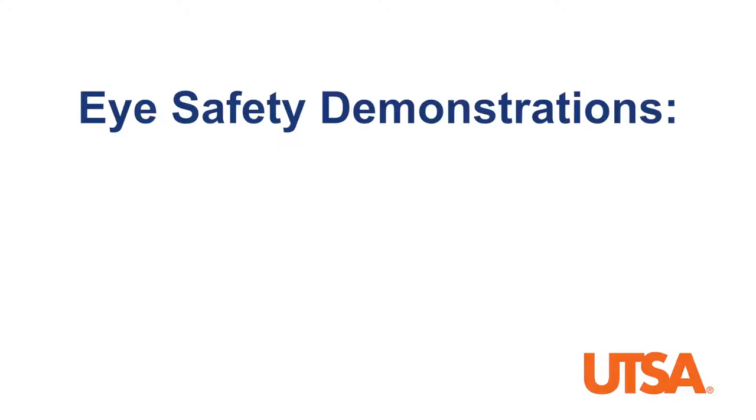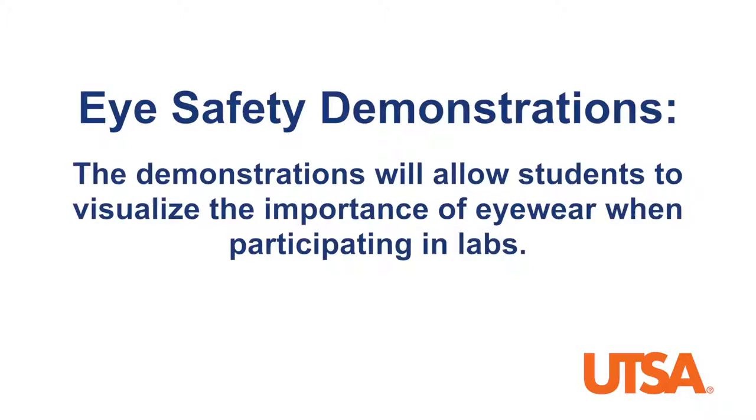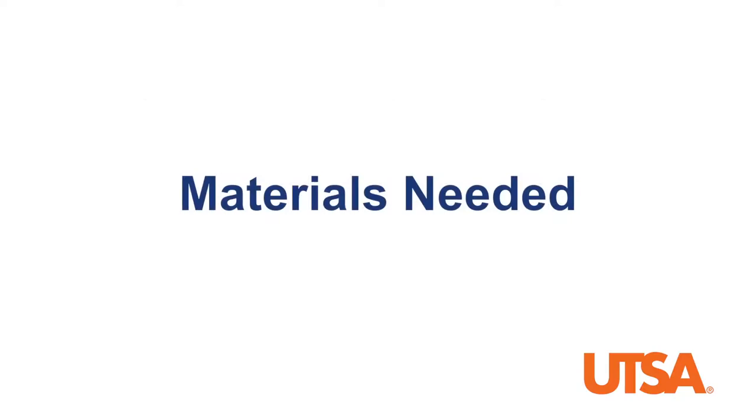Today we will focus specifically on eye safety with three demonstrations: denaturing an egg, contact simulation, and well-fitting goggles. The three demonstrations will allow students to visualize the importance of eyewear when participating in labs.